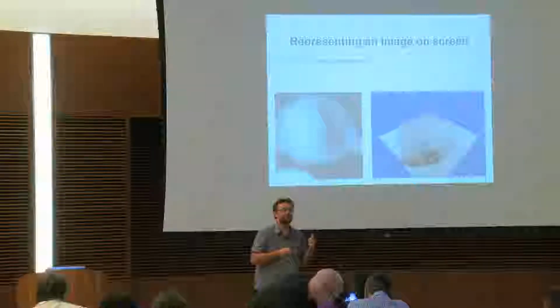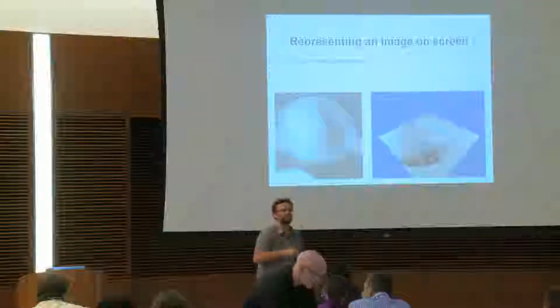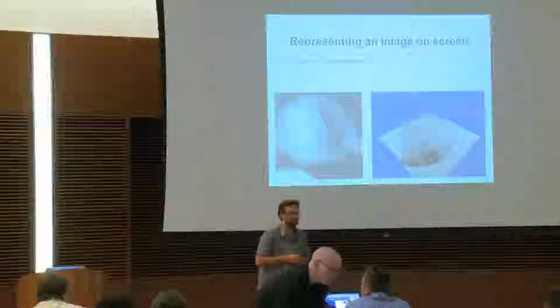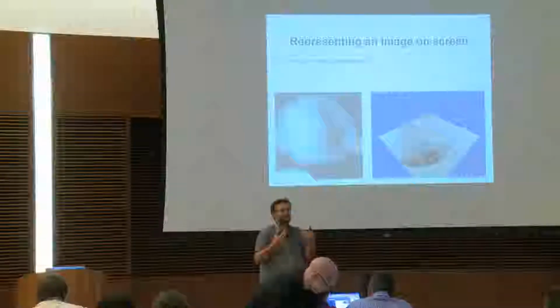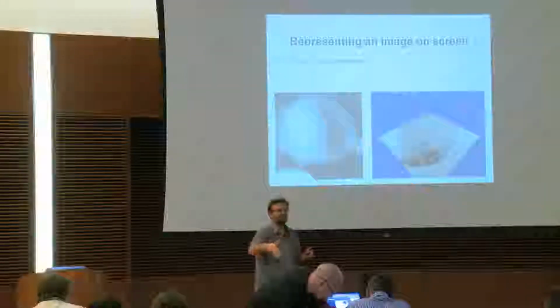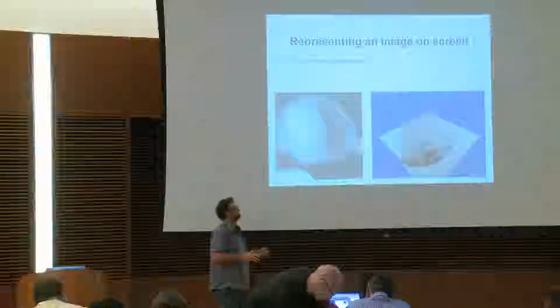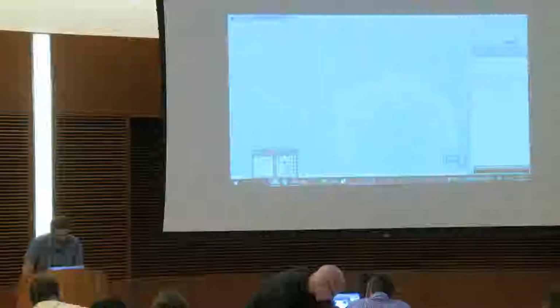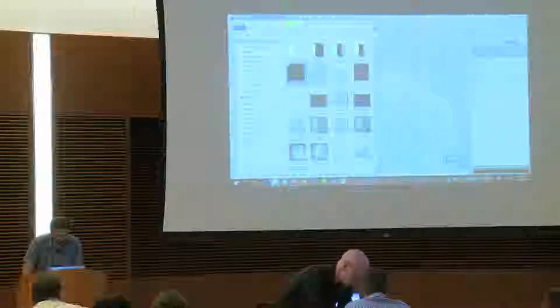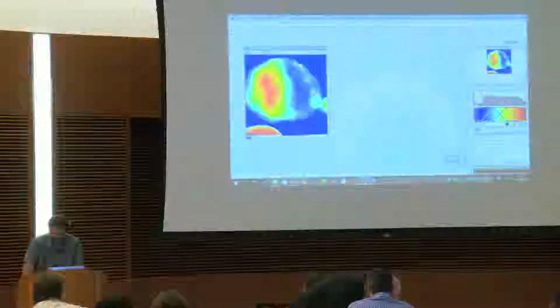A good solution to find the knobs in here would be to use what we saw this morning. It is called the background subtractor, with these famous rolling ball things that you saw this morning. During the talk, I was trying it to see if I didn't fall into the same trap as the one we are going to face. And in fact, no, it doesn't help for this problem. So if you can open this image here, knob test 16-bit per pixel.tif.